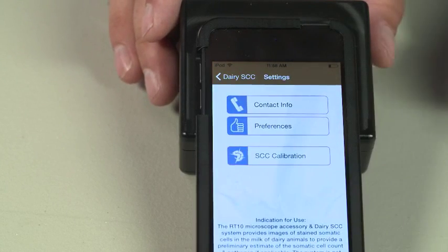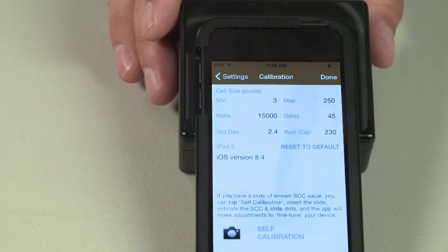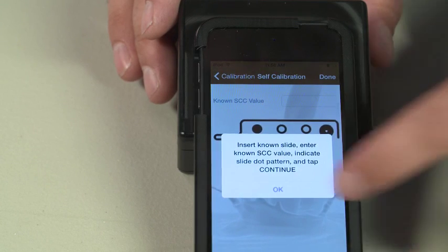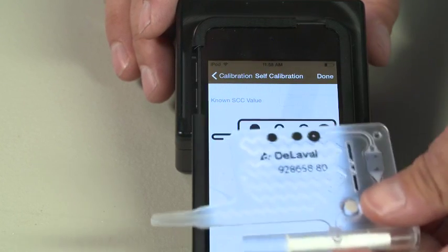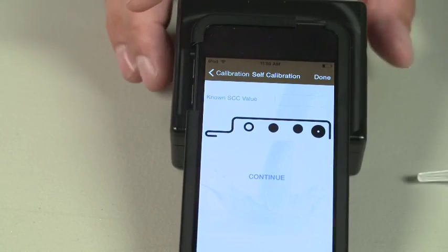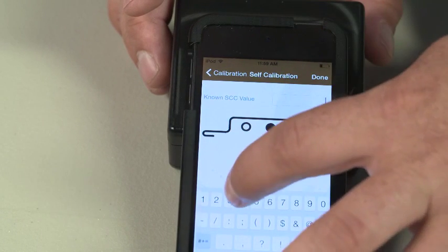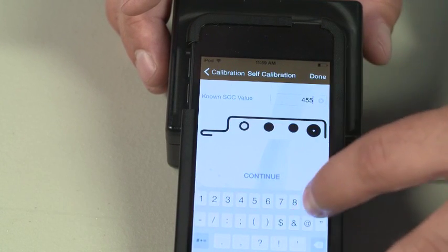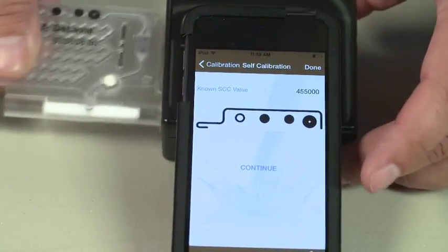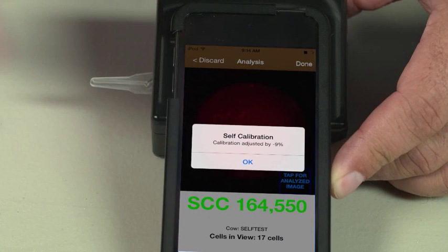To self-calibrate, tap Settings. Tap SCC Calibration. Tap Self Calibration. Tap OK on the alert message. Align the dot patterns. Tap Known SCC Value and enter the value. Insert the slide. Tap Continue. You will receive an alert message that the settings have changed — hit OK. These new settings will take effect on the next test.